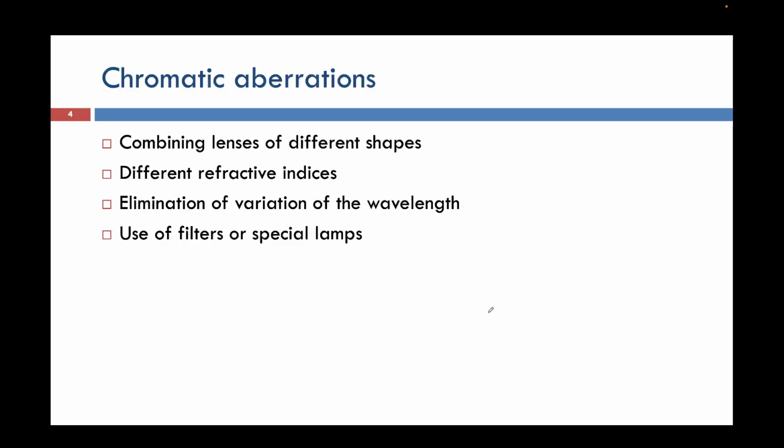So this lens will cause more problems for us, because every time we cannot use a single color like red or blue in a simple optical microscope. I simply want to look at a few structures. For that, if I have to customize my optical microscope, then the cost will also be higher. So instead of generating monochromatic light, I want to minimize the chromatic aberration by some other method. So what is that other method? Combining lenses of different shapes.